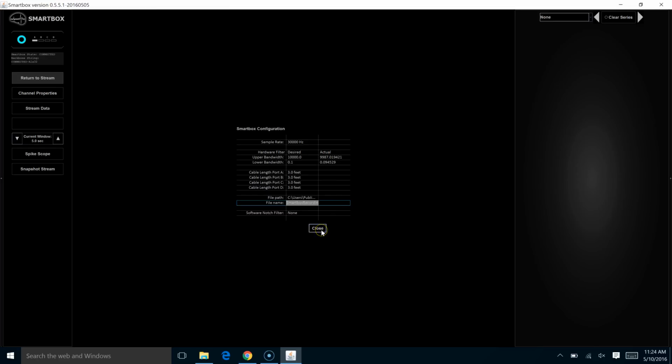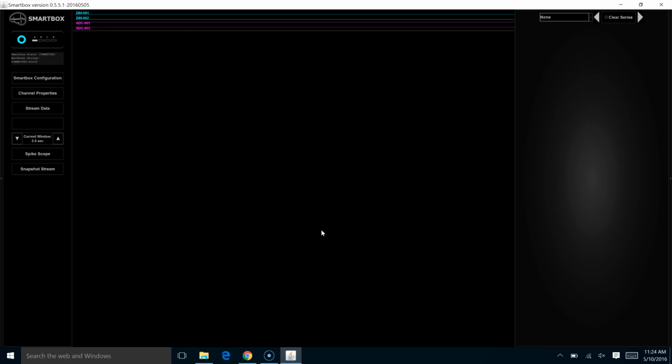All right. Now that we're set up in the configuration area, we can close and we're just about ready to start recording.